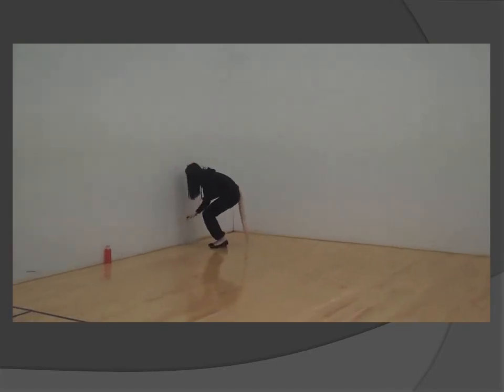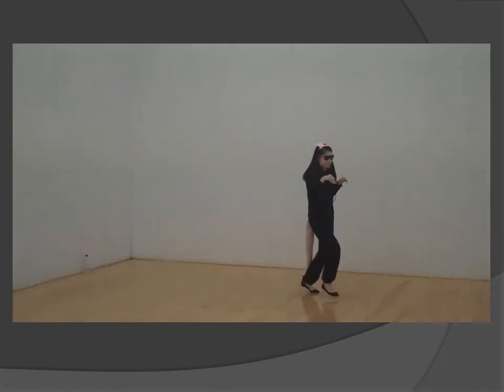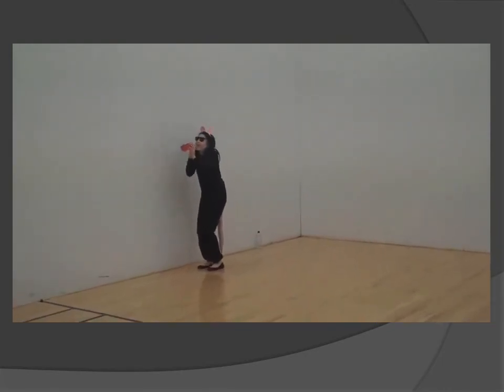Here's an example of a rat performing the sucrose preference test. The rat starts off by drinking the water, then tries the sugary red drink, and as you can see, the rat will end up preferring the sugary red drink to the water.